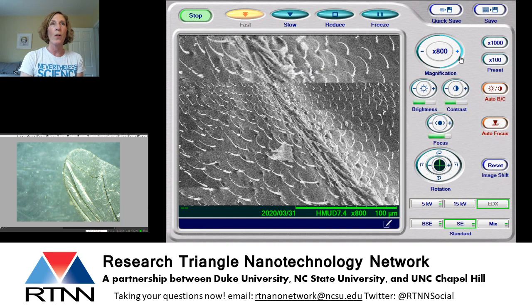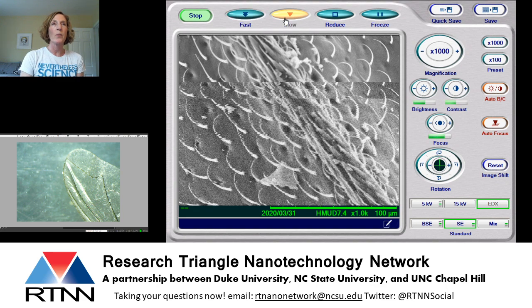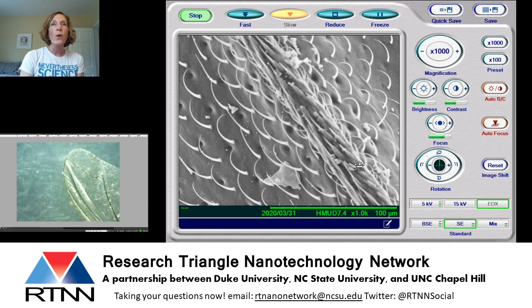I want to show you guys how cool this vein looks on this fly wing. So it looked like a little bump when we were looking at the fly wing zoomed out. You can see it has all of these cool little spikes and barbs on it. It's so neat. I had no idea that that actually was what that looked like until I looked at this today. To remind you guys, now we're 1,000 times magnified, so we're way zoomed in. And if you put a hair in this picture, your hair would be the full length of this bar right here. This is awesome, right? This is why we wanted to bring this to you guys, so you could see just how cool it is when you look this close at the wing of a fly.